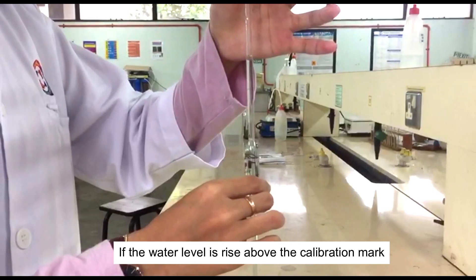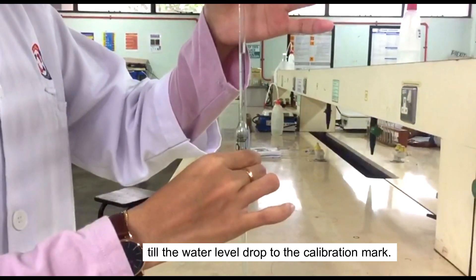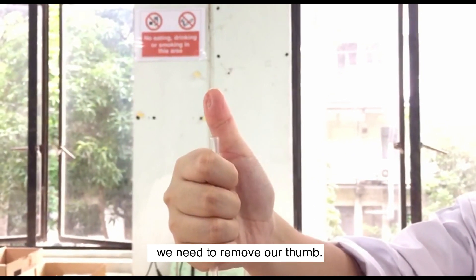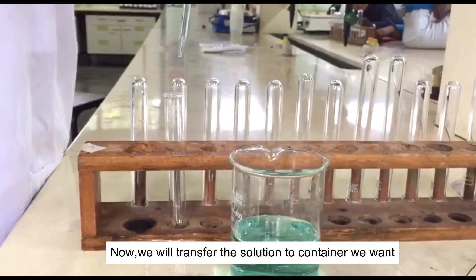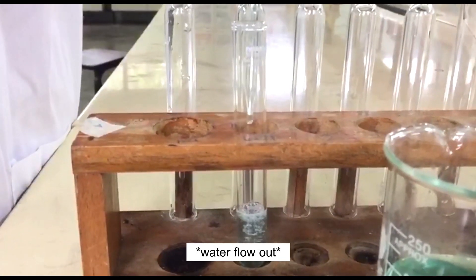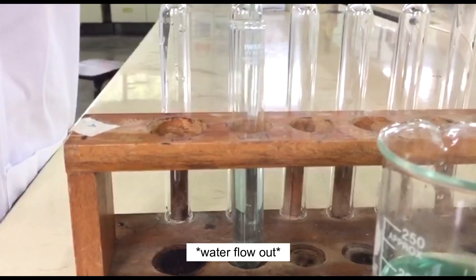If the water level is rise above the calibration mark, we will spin the pipette slowly until the water level drops down to the calibration mark. To let the water flow out from the pipette, we need to remove our thumb. Now we will transfer the solution to container we want.